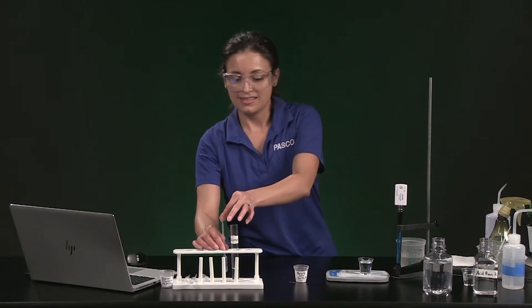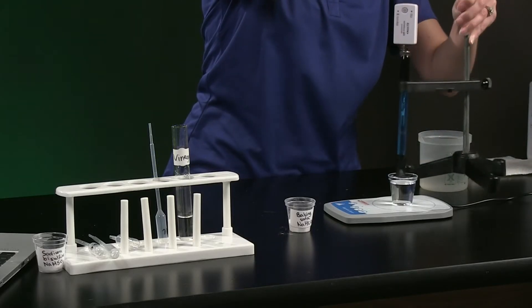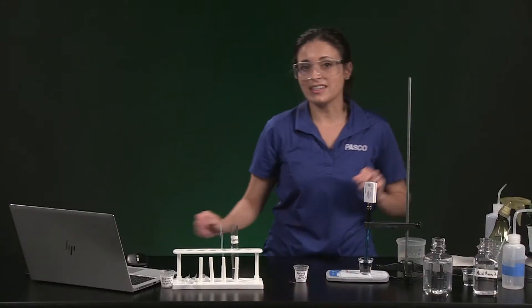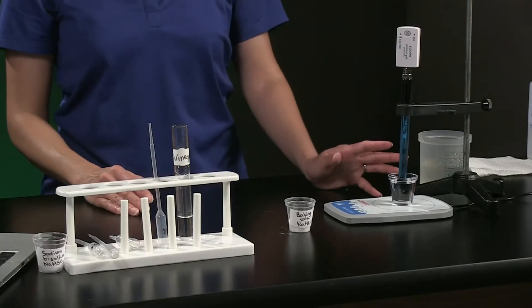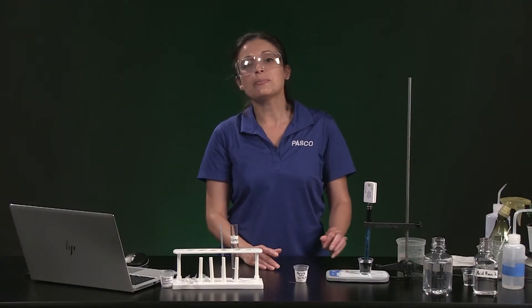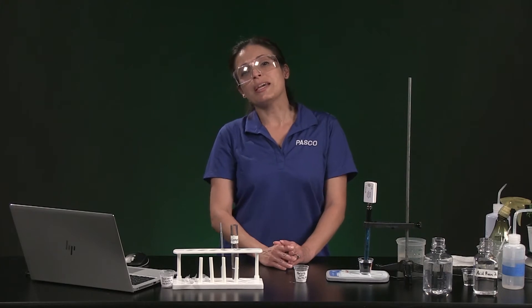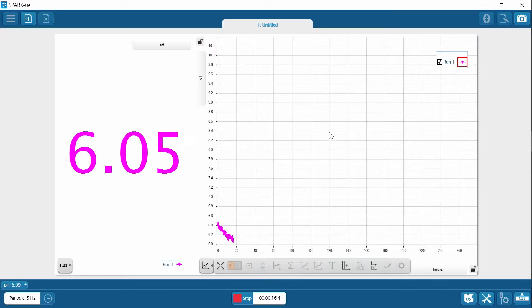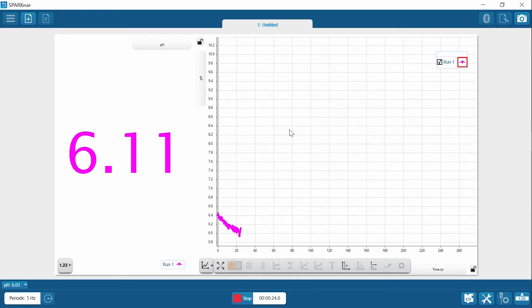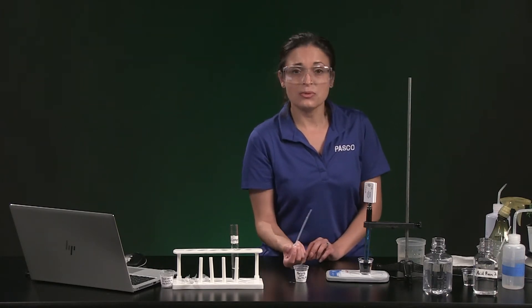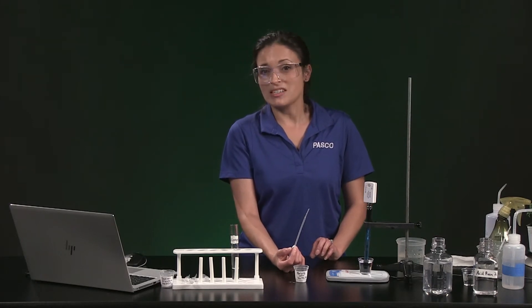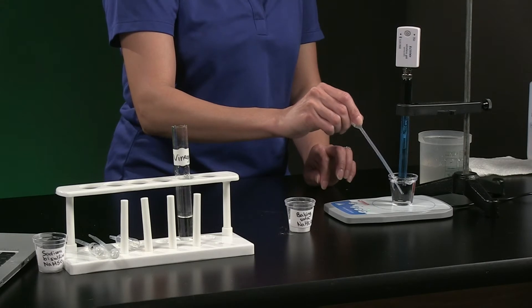Next, I will place the pH sensor into the 25 milliliters of distilled water and start collecting data. Since I don't have a lab partner to help me stir and hold the pH sensor, I added a microstir and a ring stand to my setup. When I say to record a value, you might want to pause the video so you can write down the data on your paper. Record the initial pH in table 1 once it stabilizes. Now I am going to squeeze the carbon dioxide gas contents of pipette 1C into the water and stir the solution while continuing to collect pH data. We will speed up data collection for you.